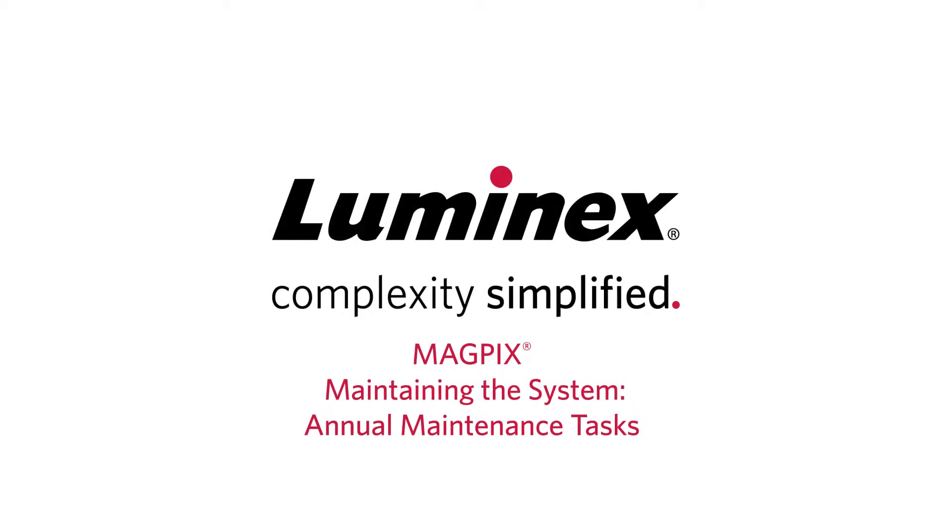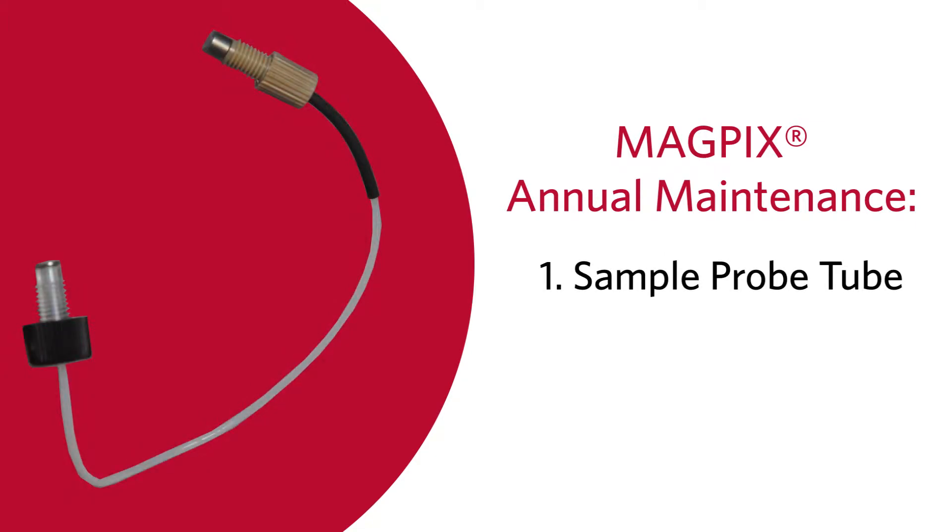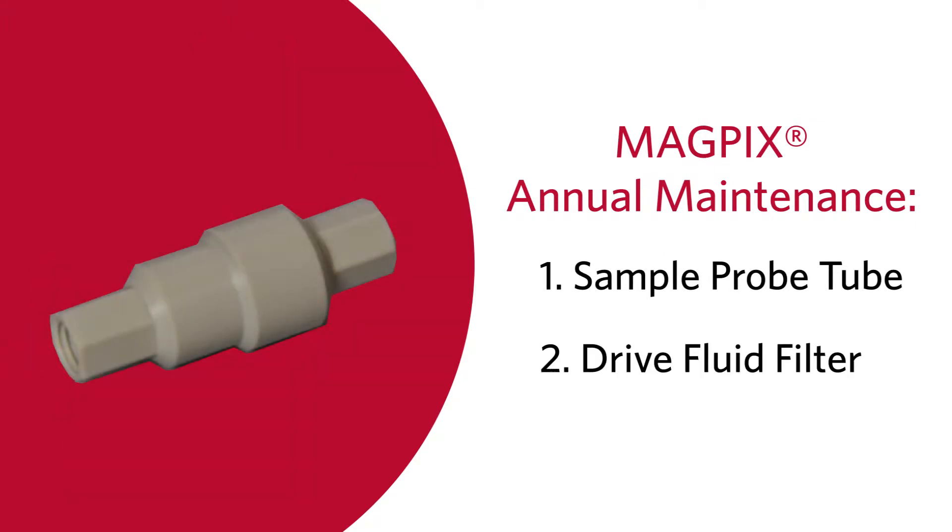Let's learn how to perform the annual maintenance tasks on the MAGPIX. The annual maintenance tasks for the MAGPIX system include replacing the sample probe tube and replacing the drive fluid filter. Semi-annual maintenance tasks should also be performed at this time, and semi-annual maintenance is covered in a separate video.